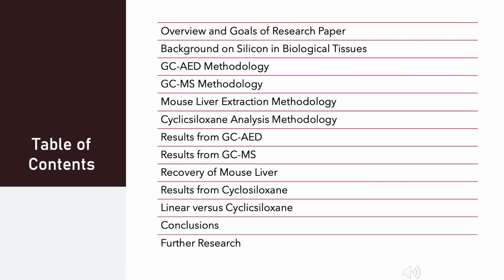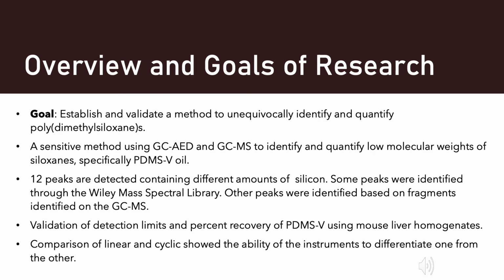The goal of this paper was to validate gas chromatography methods that would identify and quantify polydimethylsiloxanes. Throughout the rest of the presentation, I'm going to refer to this as PDMS. For the first analysis, PDMS-V oil was used. This is the linear form of PDMS.